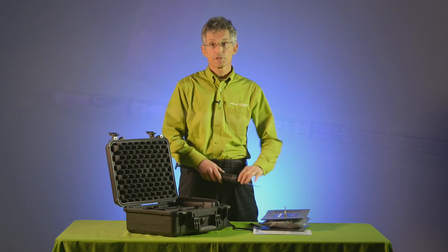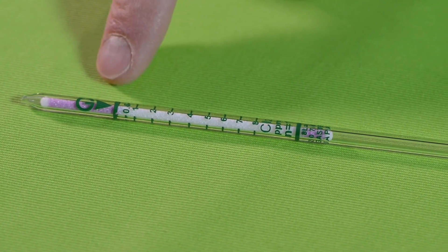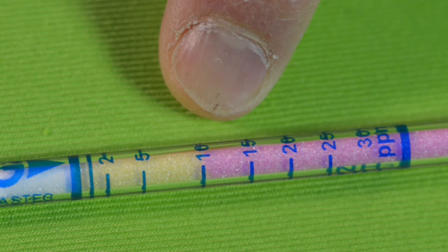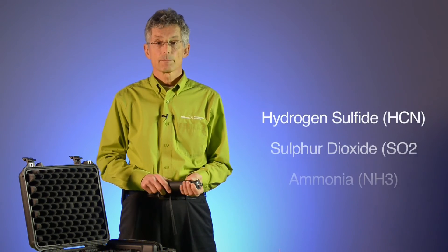Using the same procedure, we see here that there is no indication on the chlorine tube. However, there is a response on the 12L hydrogen cyanide tube. At this point, we have narrowed down the unknown to hydrogen cyanide, sulfur dioxide, or a basic compound such as ammonia.